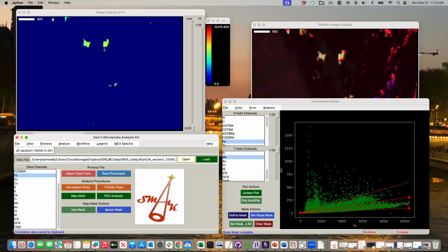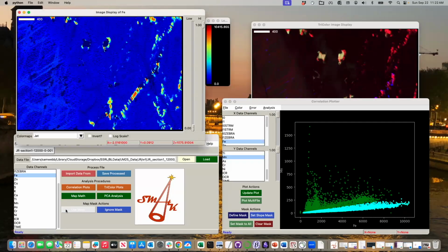And then we could go back here now. So it actually made that whole area, closed it up. If I go to my highlight mask, it should be there. And we could say use mask here. And those are all the bits that fall into that category.